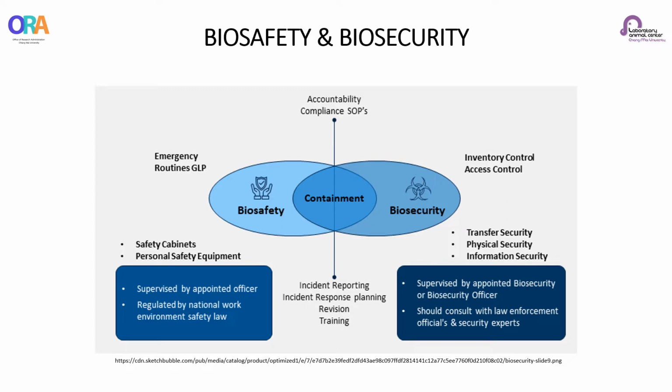However, the goal is to prevent the loss, theft, diversion, or intentional misuse of infectious agents. Both biosafety and biosecurity programs depend on risk assessments, personnel expertise and responsibility, control and accountability for research materials, access control, training, and emergency planning.